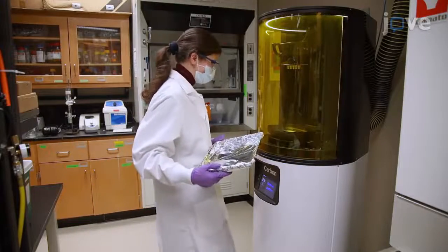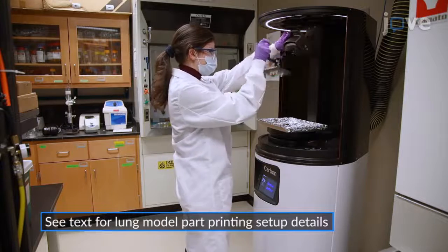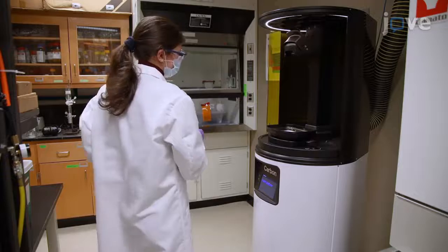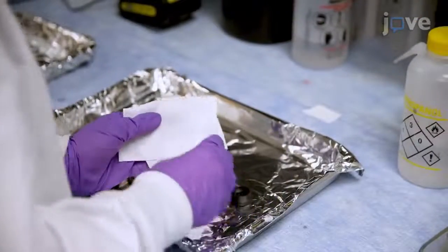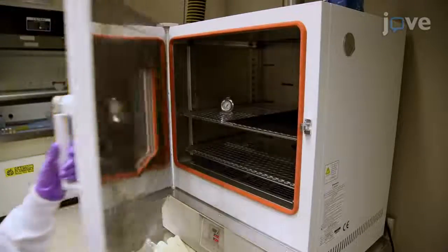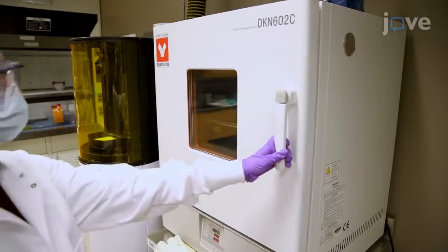After printing the experimental components and completing post-processing as per the manufacturer's instructions, carefully wash the parts printed in soft resin with at least 99% purity isopropyl alcohol to remove any excess uncured resin before thermal curing the parts in a convection oven for 8 hours according to the manufacturer's specifications.